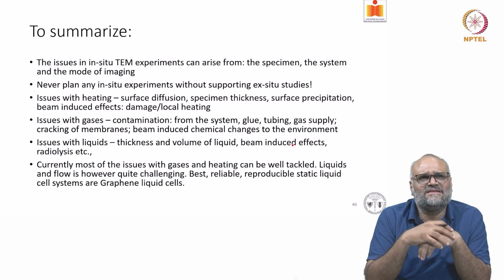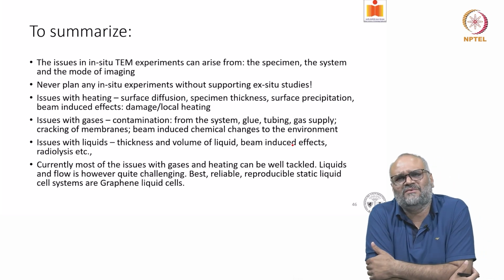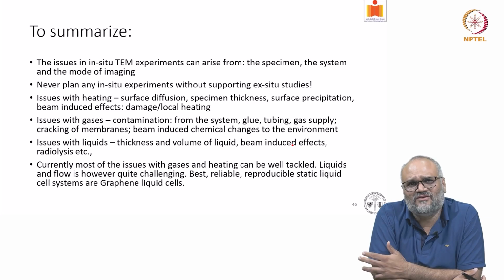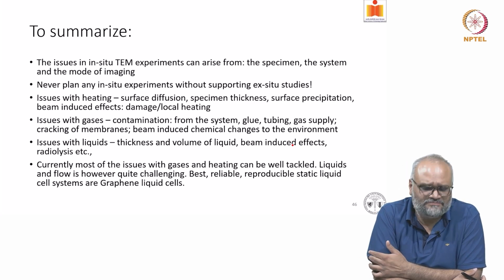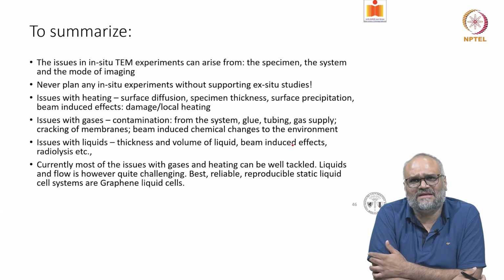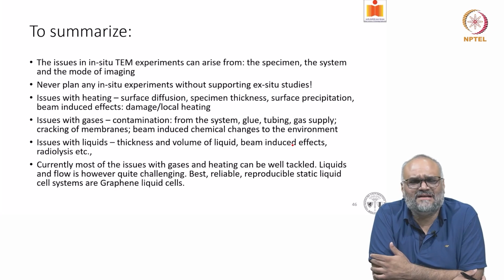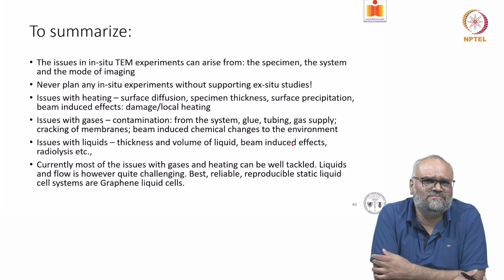The issues with gases are predominantly contamination from the tubing or the system or the gas that you use. You also have issues with cracking of the membrane and beam-induced chemical changes to the environment. And for liquids, I've not covered liquid cells here, but you also have issues related to thickness, volume of the liquid, beam-induced effects such as radiolysis, and so on.